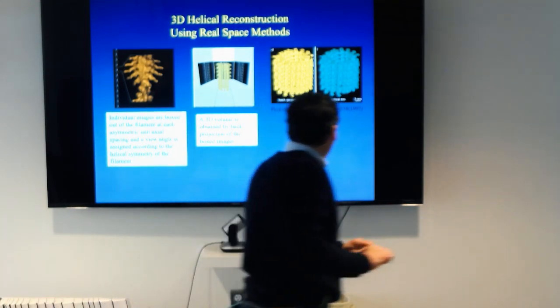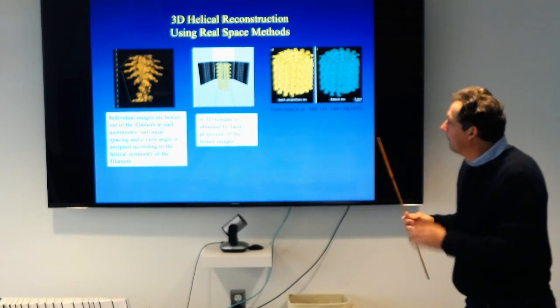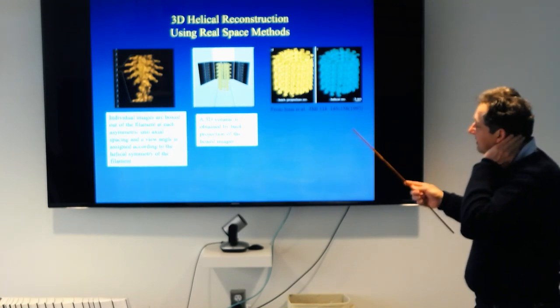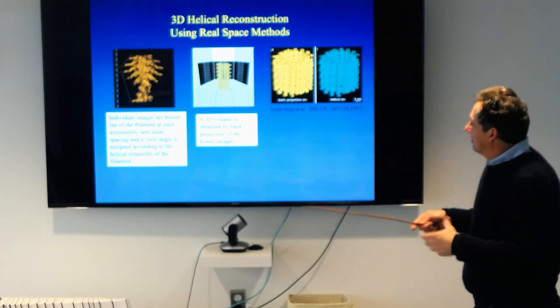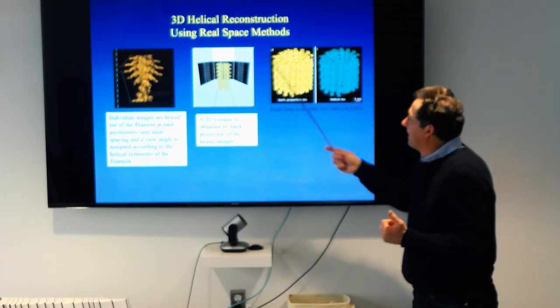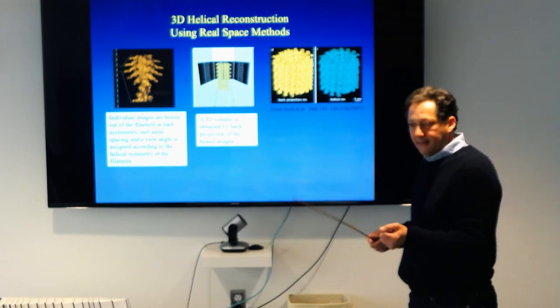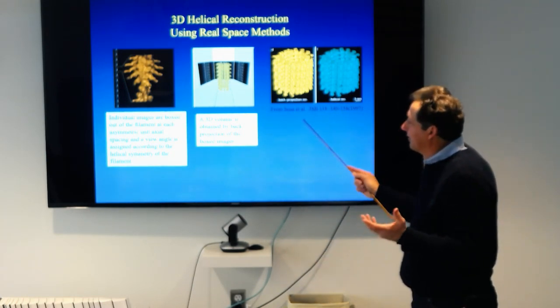So that's all I'm going to say about going through the Bessel Fourier. Most likely you're going to use software, but it's important to know where all the terms come from. A long time ago, we realized that we could also use real space methods to analyze a specimen, and of course they give equivalent results.